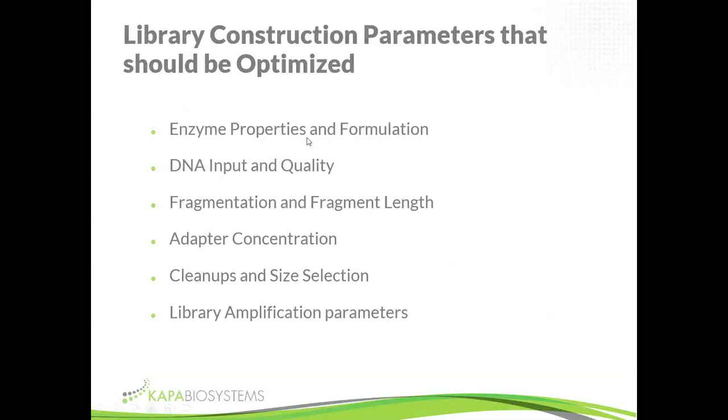So just looking very briefly at enzyme properties and formulation, DNA input and quality, fragmentation and fragment length, adapter concentration, cleanups and size selection, and then talk a little bit about library amplification. A combination of good strategy, good chemistry, and well-optimized parameters essentially allows you to make the best possible library from your sample. Let's start off with enzyme properties and formulation.